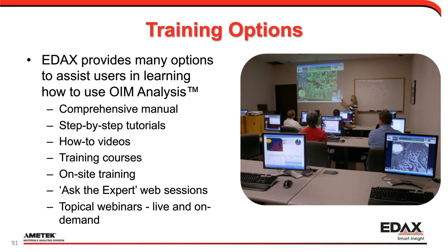I keep saying things like there's a lot in there, and there is. So one of the things we like to emphasize is some of the training options that are available to help users learn how to take advantage of these features within the software. The manual is actually really good. We have step-by-step tutorials, and with OIM 8, those have all been redone to also highlight some new features. There are how-to videos available. There are training courses available. There's on-site training available. We have Ask the Expert web sessions where basically you can call in and ask questions, and we try to address them.